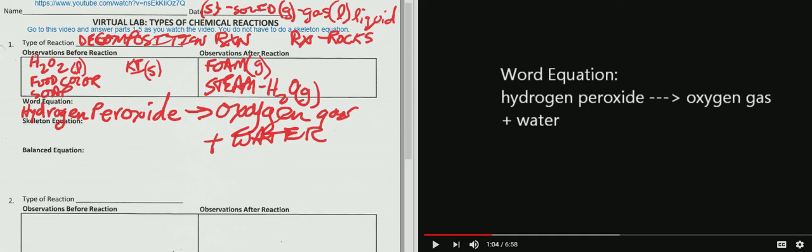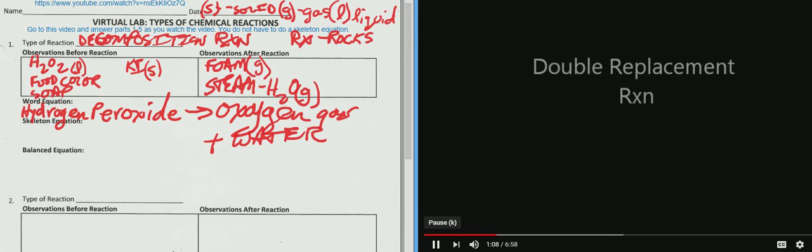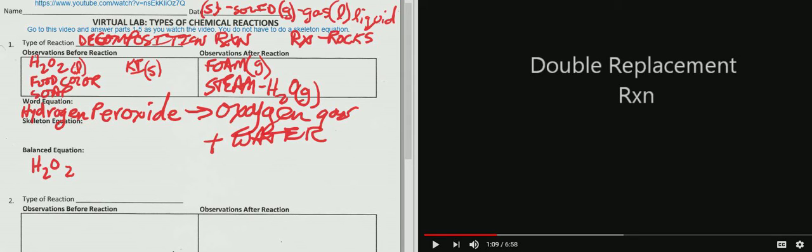Okay. And then you click play again. But before you do, hydrogen peroxide is H2O2, and that is a liquid. And it is broken down into H2O plus O2.